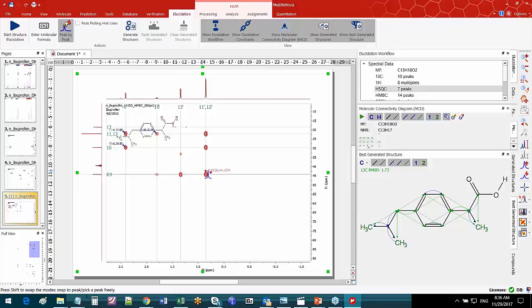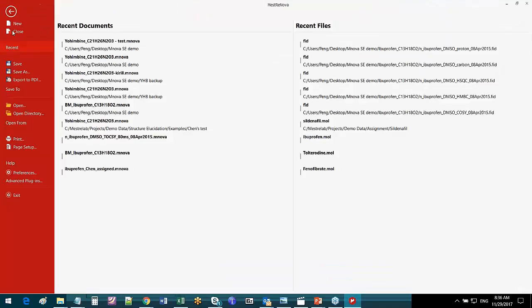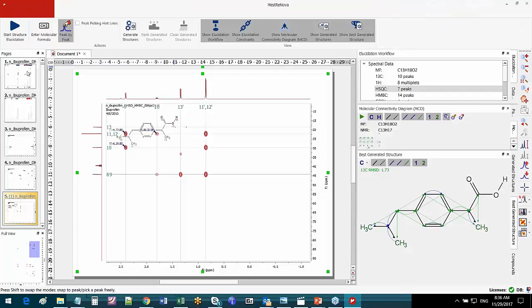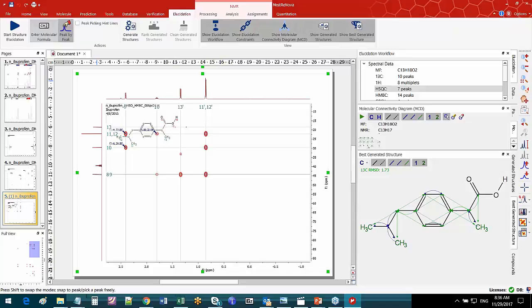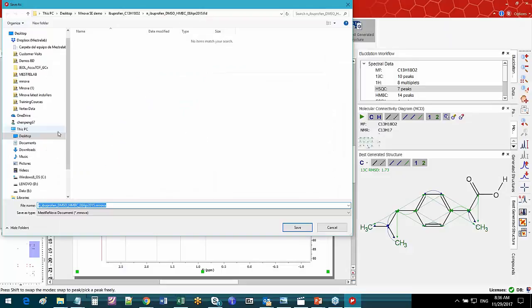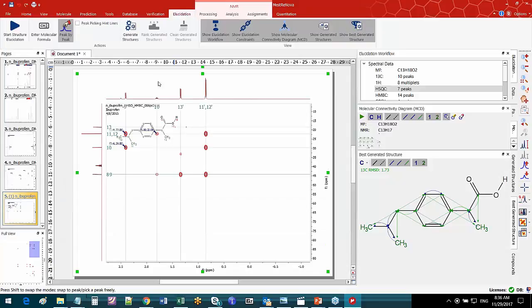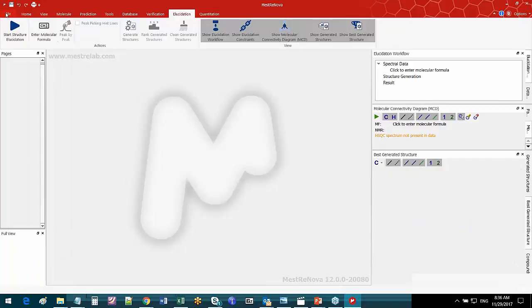I hope this gives you an idea. Next I will just show you quickly, since time is limited, another case. Once this is done, I can save it as whatever name I like, and then everything will be there. Then I will just close it. So next I will go to the browser and open another one.